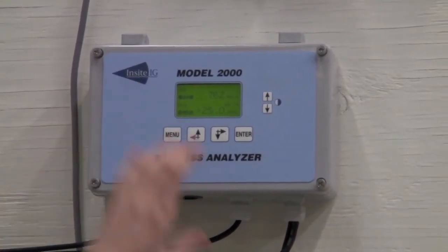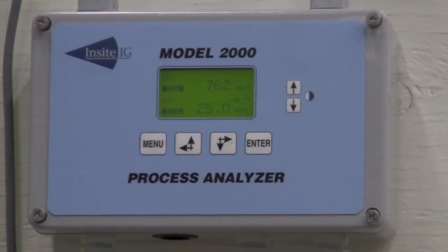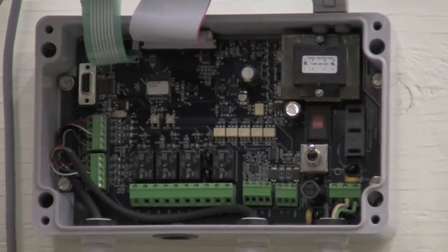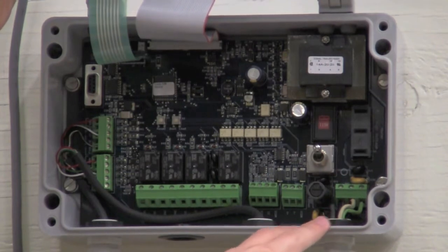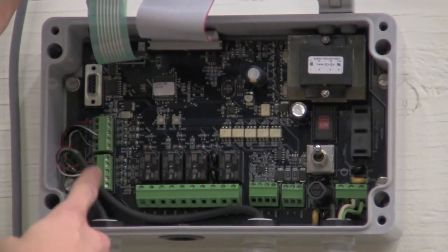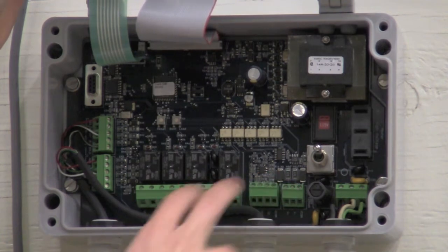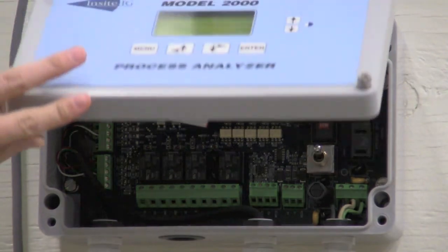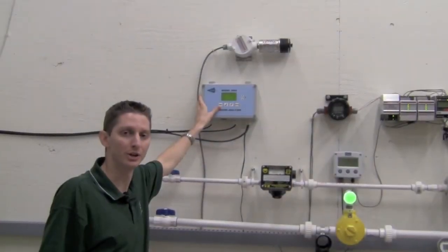As you can see, we actually have a dissolved oxygen and a total suspended solids probe in our tank on the top in the water and we're giving you a measurement. If you flip this open, you can see here you bring in your AC power into this terminal on the right, you bring in your two sensors on the left, this board is for your relays, and these two boards are for your 4 to 20 milliamp outputs.